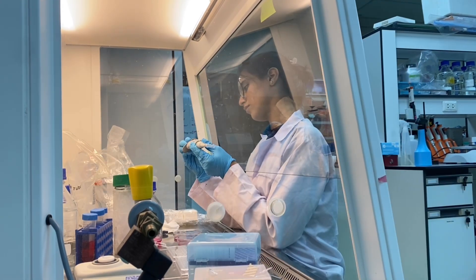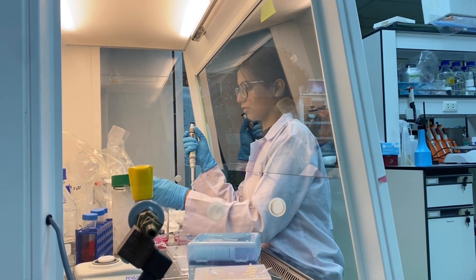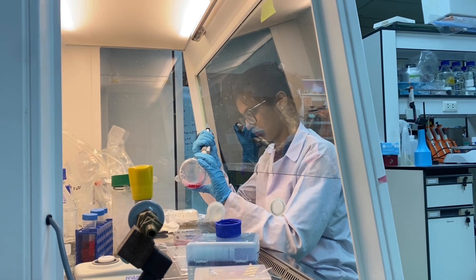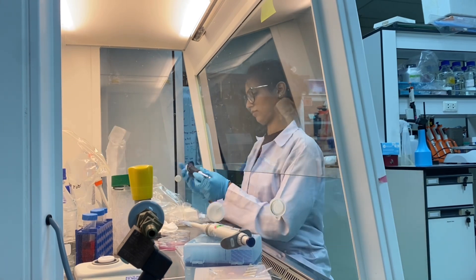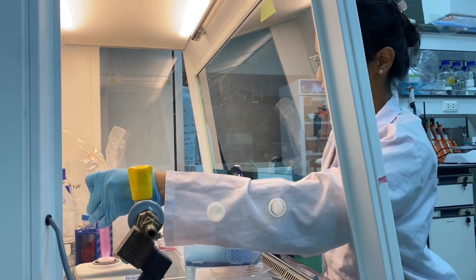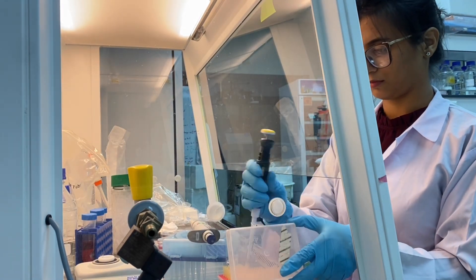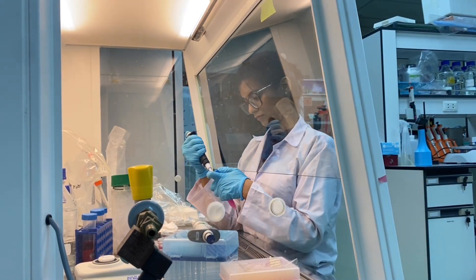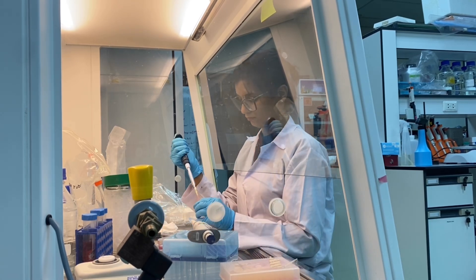Now I'm going to prepare a sample for cell counting. I'll take 950 microliters of full media and 50 microliters of my cell suspension — that's how I usually count my cells. After that, I'm going to make sure I suspend the cells well, so I'm going to vortex it multiple times.